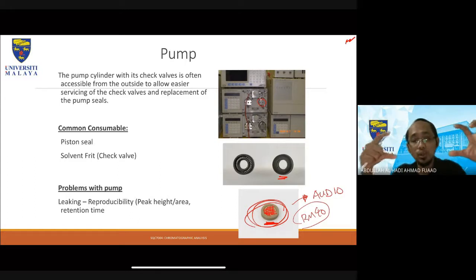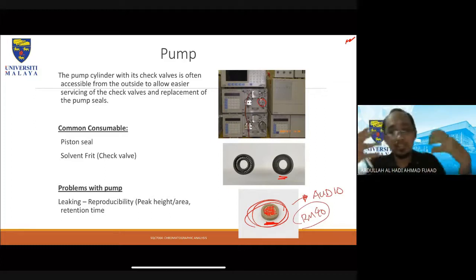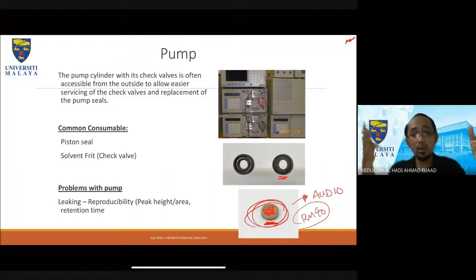One purification column like that, it's very small, it's not even one module, costs about 10,000. Okay, the good ones, of course. If you just want to buy cheaper ones, then yeah, you can get it for a cheaper price. But the ones that I normally use are the ones that can hold high back pressure. So it is normally made of stainless steel and it costs a lot. 20,000 ringgit, not dollars.